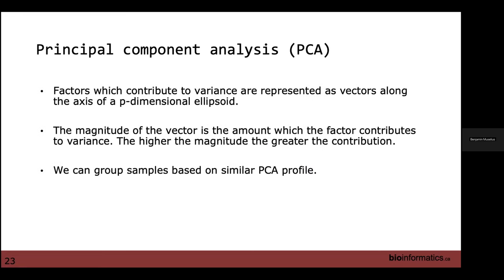Principal component analysis. A very important thing, especially when dealing with complex samples like proteomic samples, is when we do our analysis, are the differences we are seeing caused by the experiment we're doing, or are they random differences? So principal component analysis is a very good way for us to look at this.